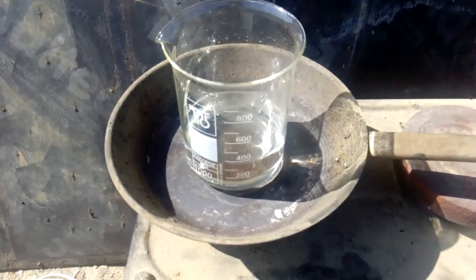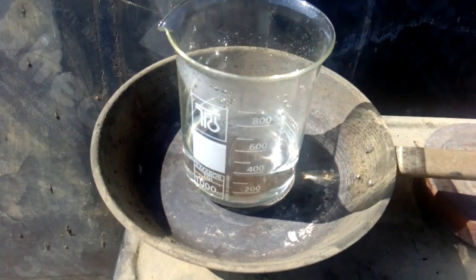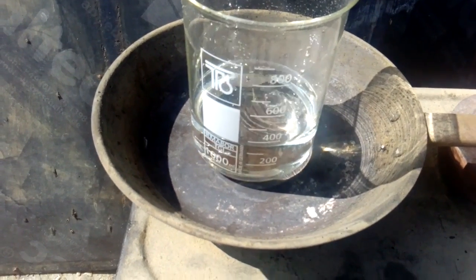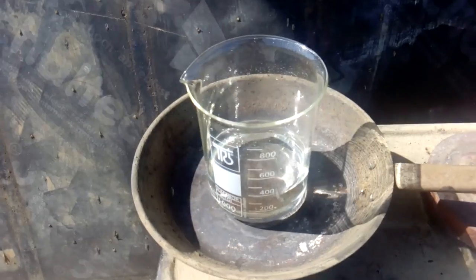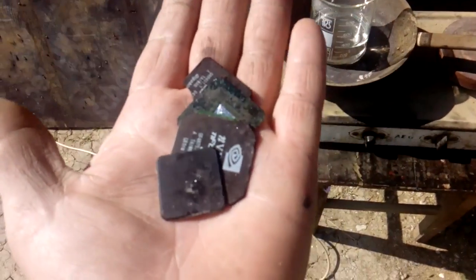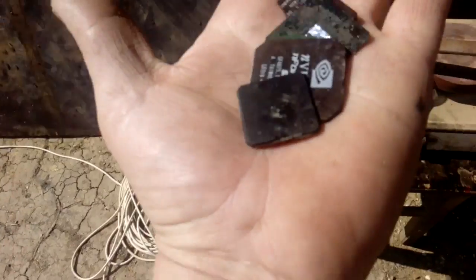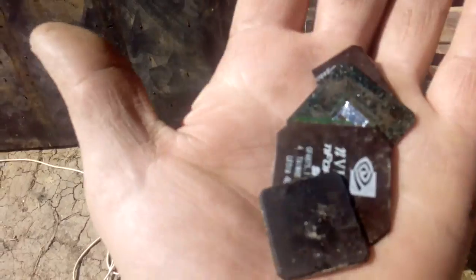Okay guys, I slowly added all the acid from the bottle - one liter total. I reduced the liquid to 400 ml, so I think that is enough concentrated sulfuric acid. Because this is just a test, I got five pieces of BGA tops, so I'll put them inside and we will see if that acid works for wet ashing.